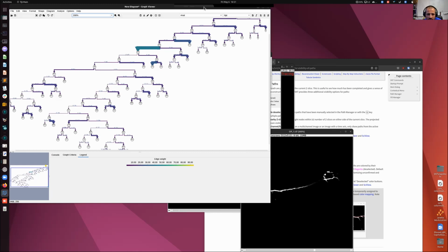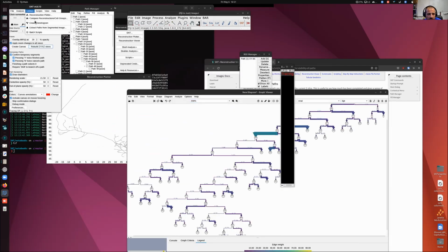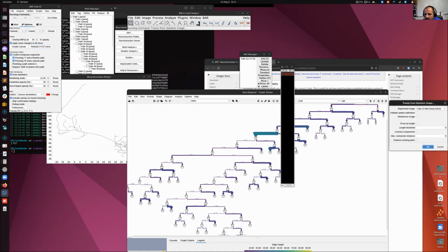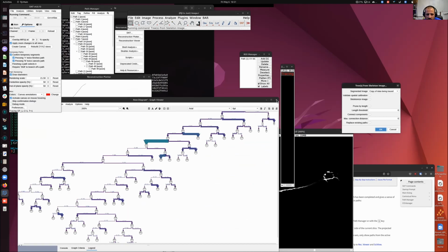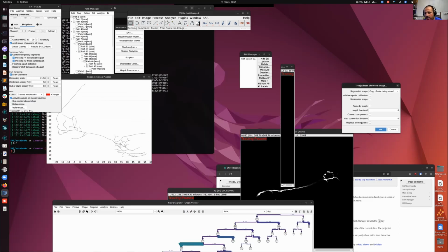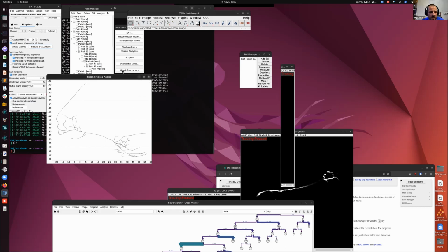Okay, in a nutshell, that's the tour. That's fully automated segmentation. You can do it too. So the way this works is through skeletonization. If you already have a skeleton, the assumption here is that the signal to noise ratio of your image is really, really good. Your image can be segmented very easily, you've already done that, and you have obtained a topographic skeleton image. We can do that if you want now.